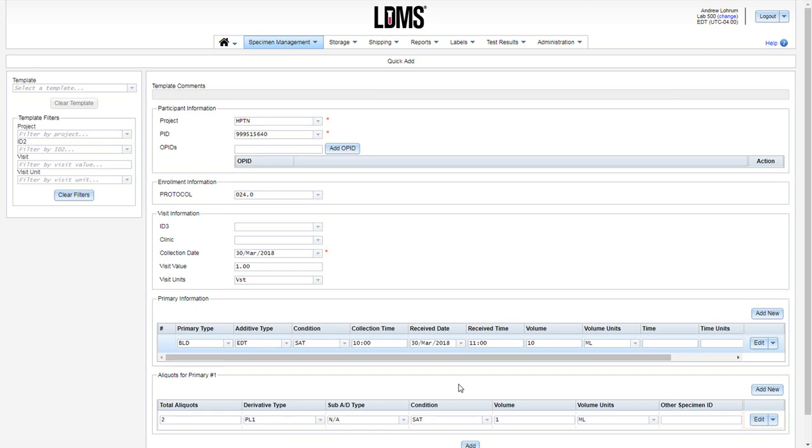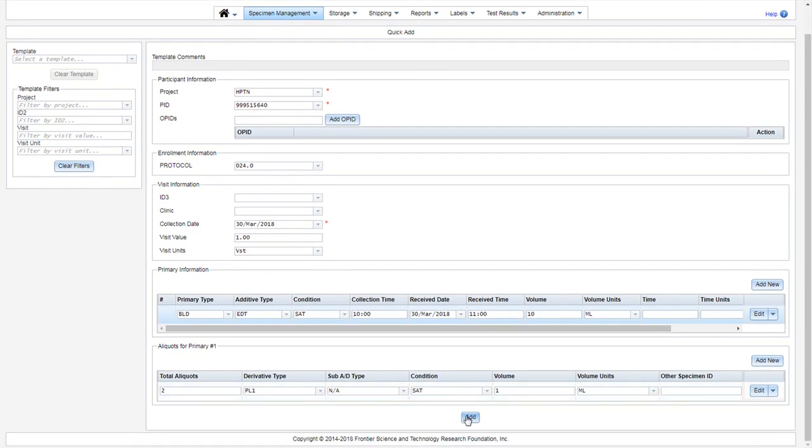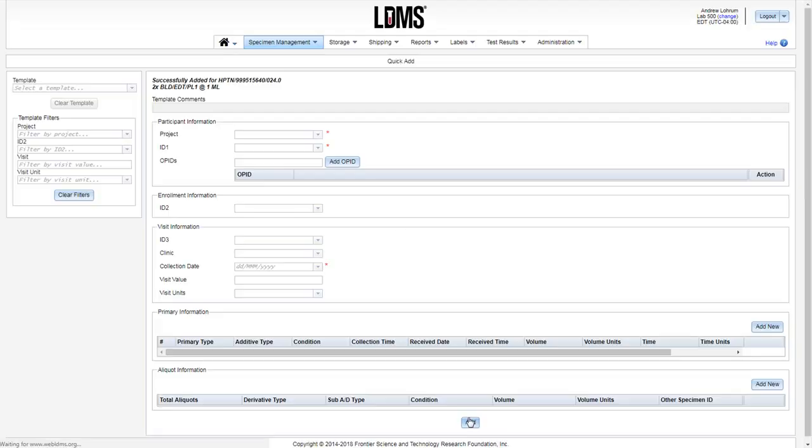This record is able to be added to our system, and we will do so by clicking the Add button at the bottom center. At the top of the screen, I have a success message, and my aliquots are enumerated. I have two aliquots of single spun plasma at one milliliter apiece.